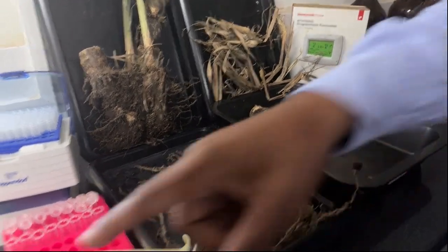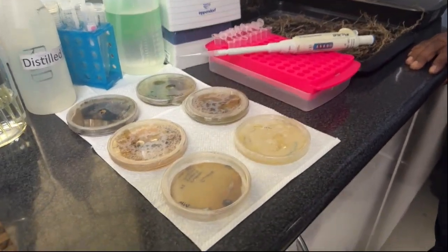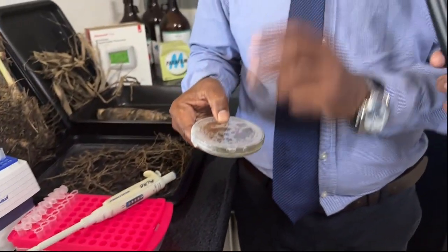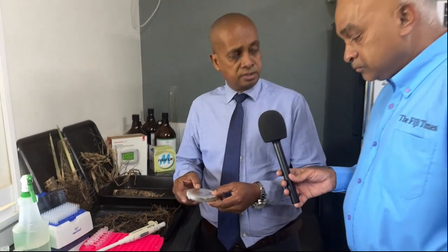If we move on here, this is where we have cultured some pests and some of the diseases, and we are trying to find out what kind of disease it is. So we'll culture it, we'll put it on a medium, and then after a while we'll observe it.